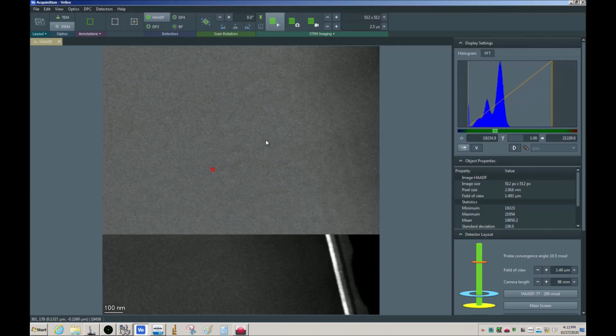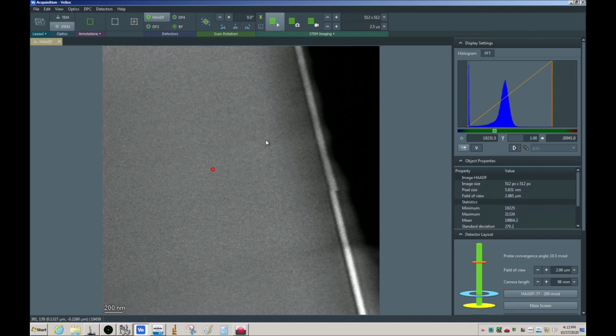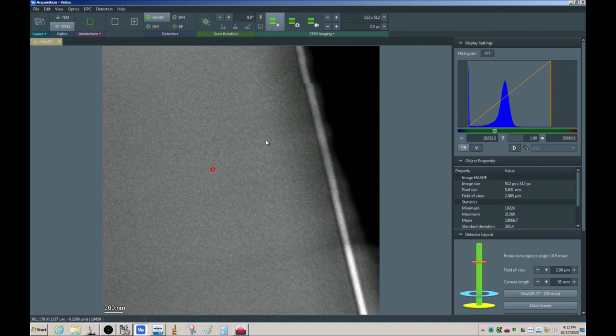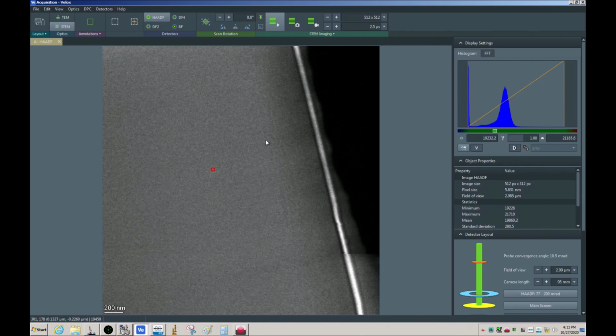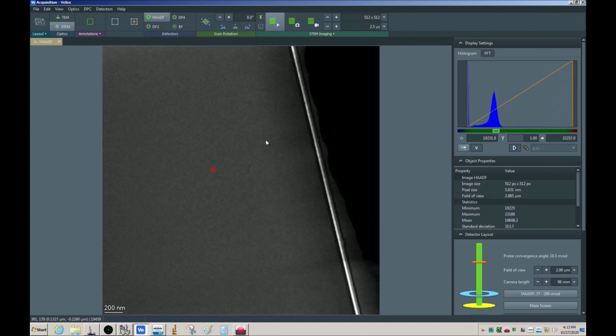Okay, and again, because the image was frozen, that was wherever the beam position marker was located, which happened to be there at the moment. So if you want to take your STEM image there, great. If not, you'd have to position it and adjust accordingly.